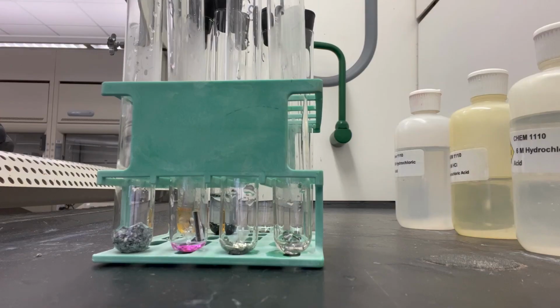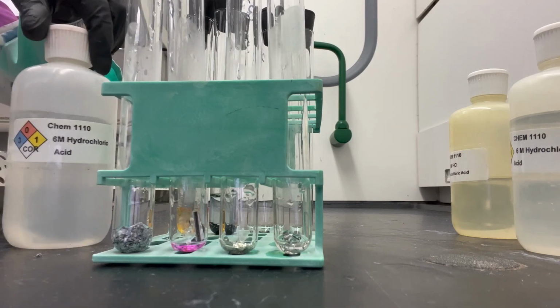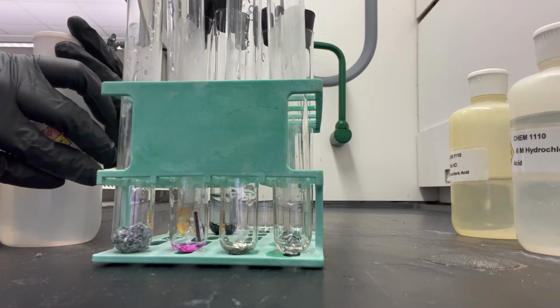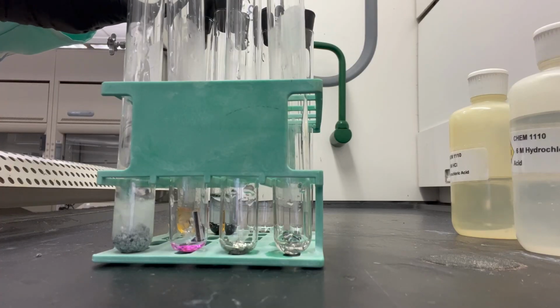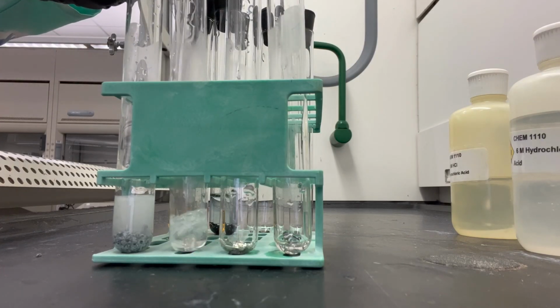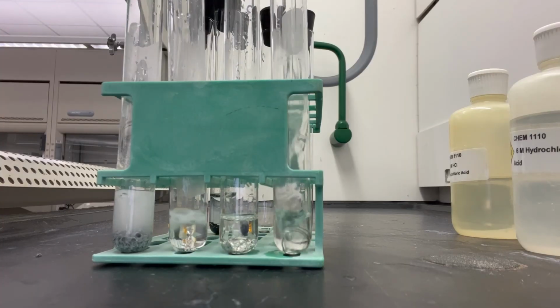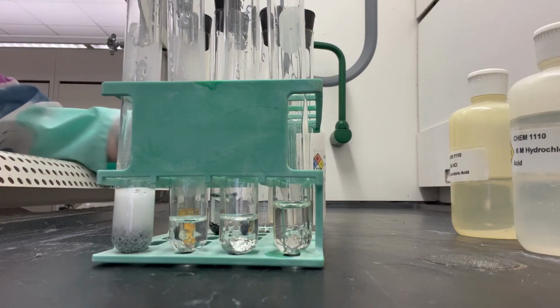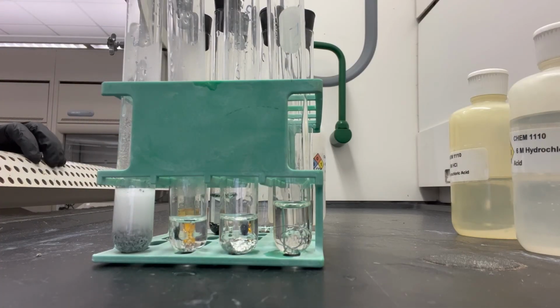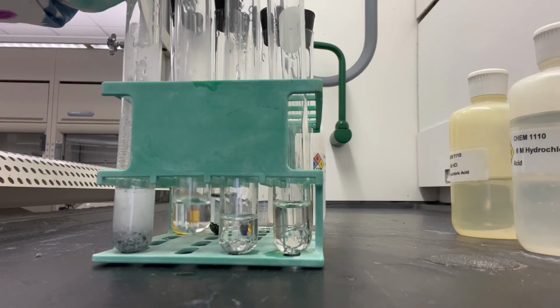Now we're going to react all of those same metals that we just reacted in water. We're going to react them with 6 molar hydrochloric acid. We see the magnesium went really, really quick.